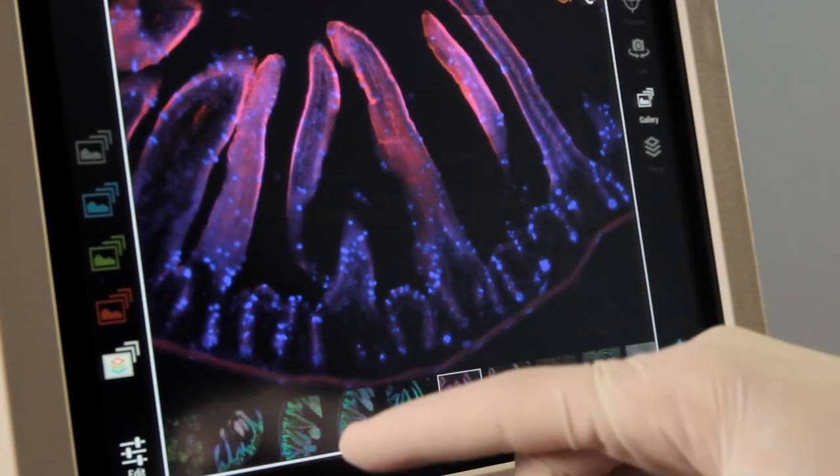And when you are ready to share your data, just export them and walk away. It's time to say goodbye to the dark room and hello to a cell imager designed for your needs.